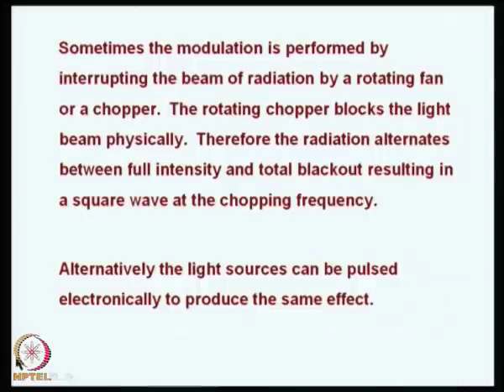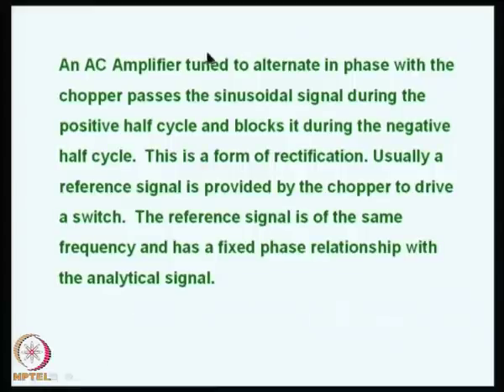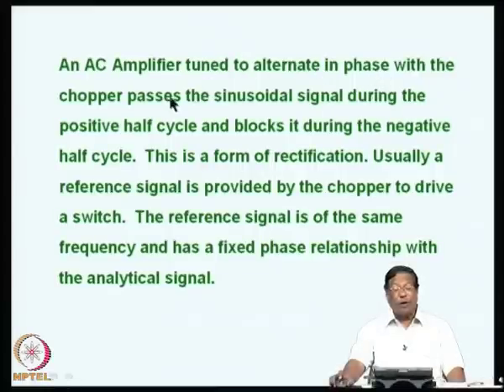We normally look for this when we use a rotating fan or a chopper. Alternately, it can be done electronically also, which we saw earlier. An AC amplifier must be tuned to alternate in phase with the chopper that passes the sinusoidal signal during the positive half cycle and blocks it during the negative half cycle.